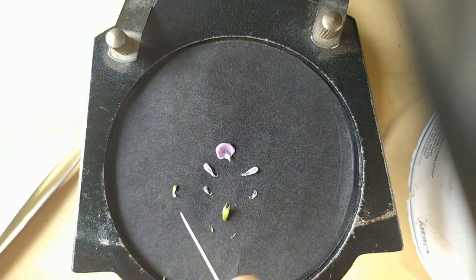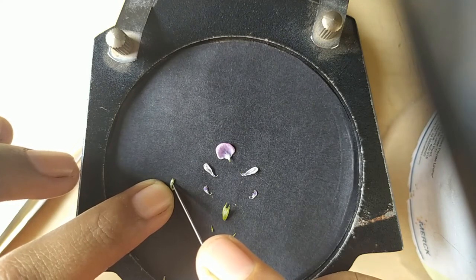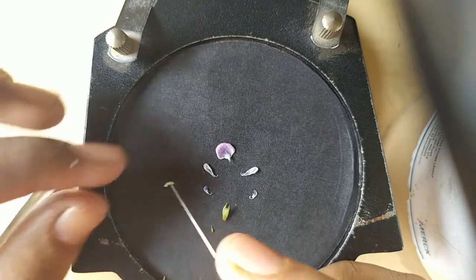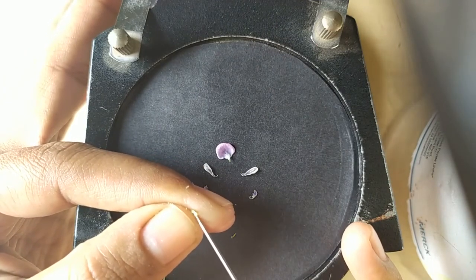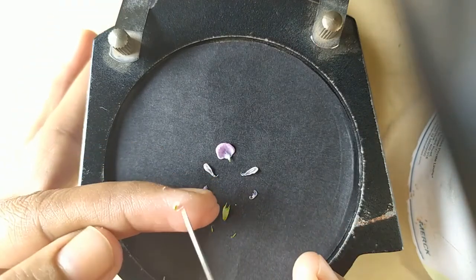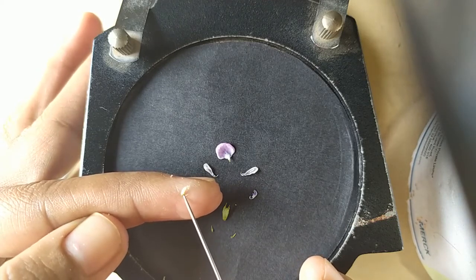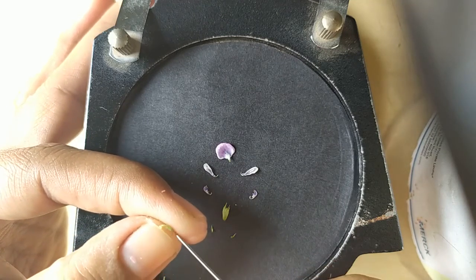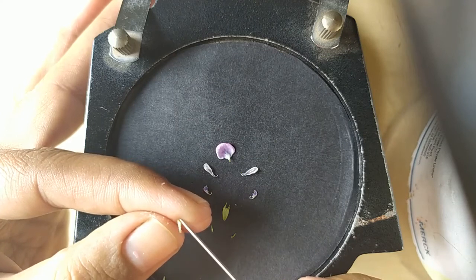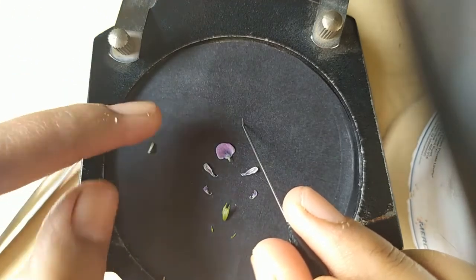The anther is so delicate and tiny, so remove it with great care. Now it got removed. See here, this one is the 9+1 condition of the anthers. Now place the one anther here.